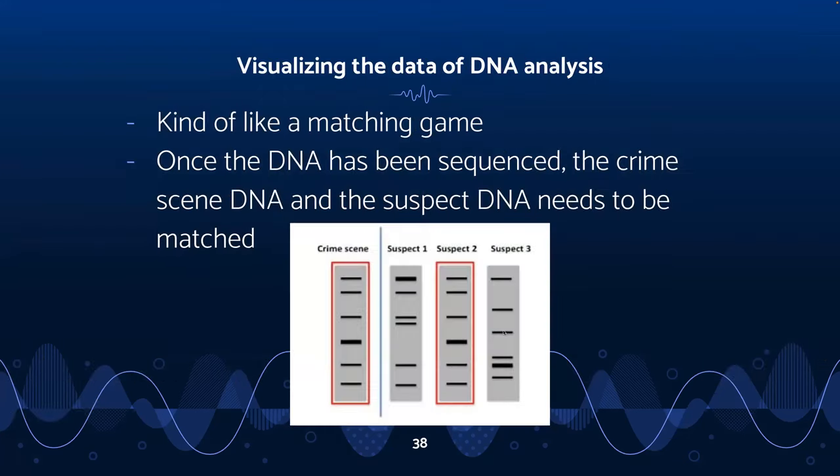All right. So now we have visualizing the DNA analysis. This is kind of like a little matching game where you have to match one DNA fragment to the other. In this picture, you can see that the crime scene and suspect two both have kind of the same sequencing, if that makes sense.